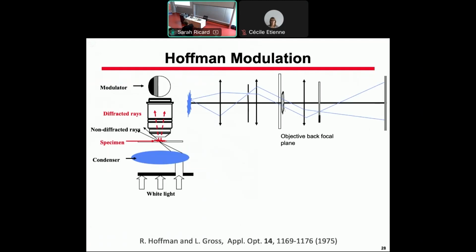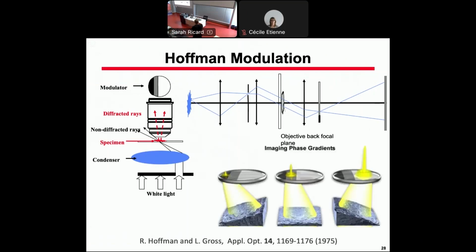Slightly absorbent. But now we understand that some rays which are diffracted will go there, some rays which are diffracted will go there, and they will experience very different absorption. And this gives nice contrasts. It's the first technique which permits a semi-quantitative interpretation of what you observe.